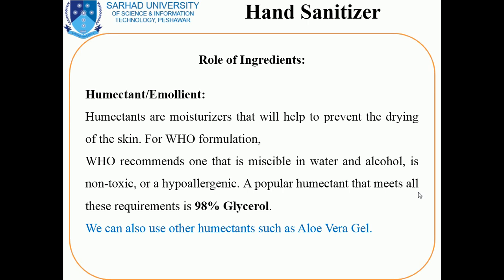These requirements are fulfilled by 98% glycerol. So the emollient we use will be glycerol because of the WHO recommendation and criteria.